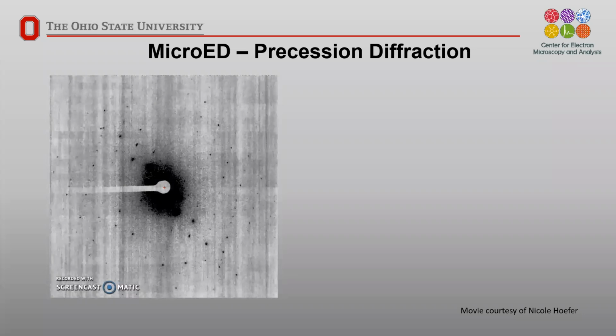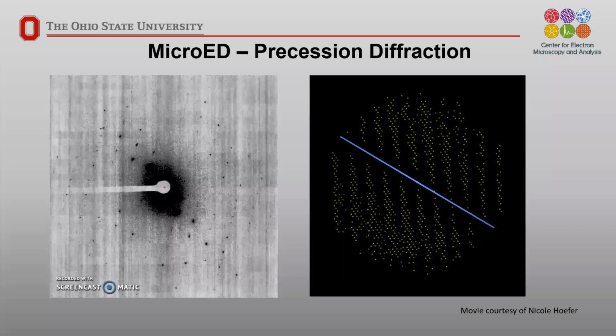and then takes all those individual diffraction patterns, puts them into a program and comes up with these diffraction spots in her pattern. Now, because it was tilting around a certain angle, you have a certain loss of information at one particular angle in the diffraction pattern. So what you do is you take another crystal at random, which would be randomly oriented, and you do the same thing. You'll come up with another pattern like this, but with a different axis where you've lost information. And then you can use the same software that the X-ray crystallography people use to elucidate a structure.